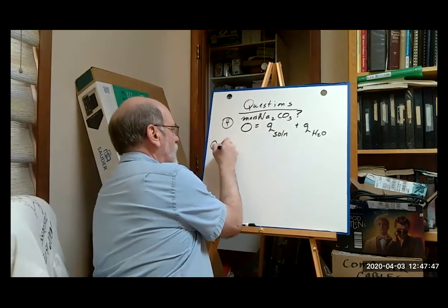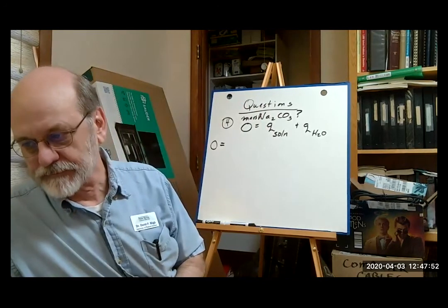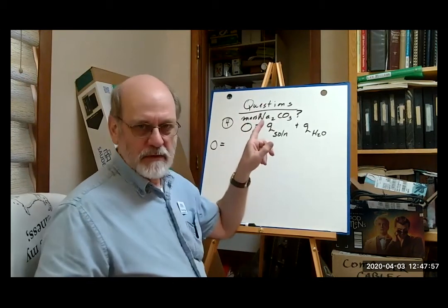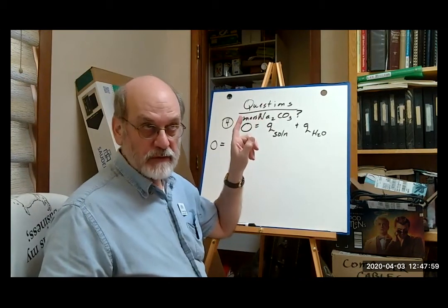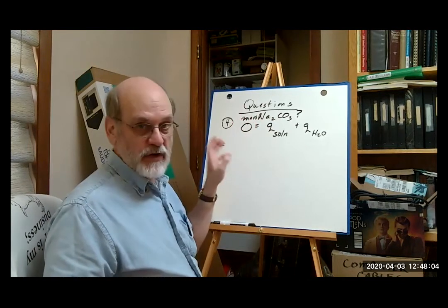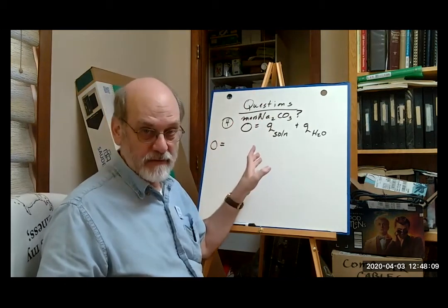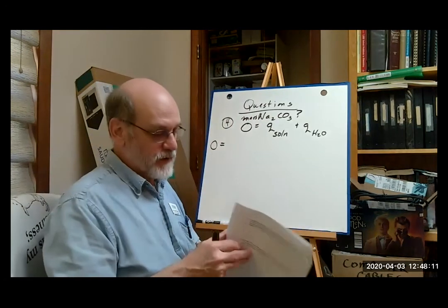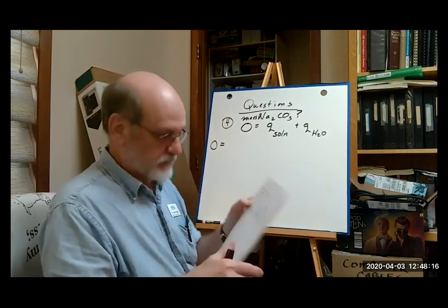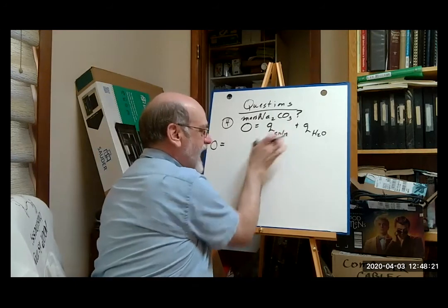So, remember what we determined earlier. We determined in part 2 the heat of that solution in terms of moles of sodium carbonate. We want to know mass. But the only term that we have is kilojoules per mole. Okay? So what we need is to say, what does that actually mean?